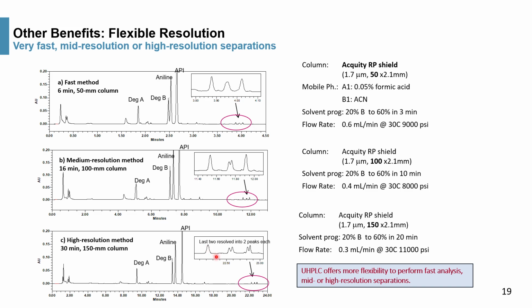Under these conditions, the time is actually not that long, right? The gradient is only a 20-minute gradient. So you have flexibility: you can use very fast and also very high resolution conditions without sacrificing too much longer analysis time.